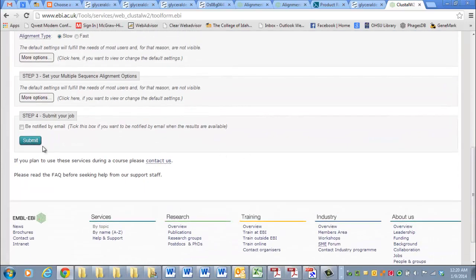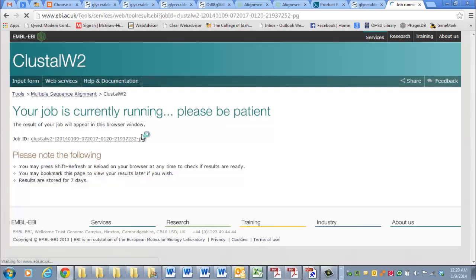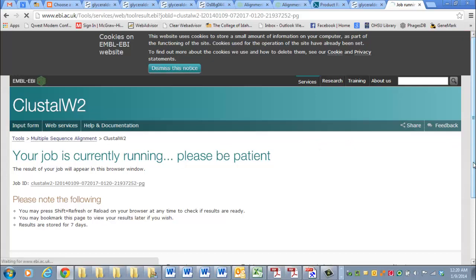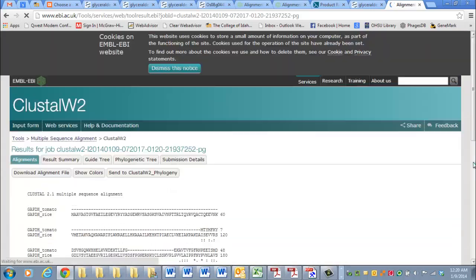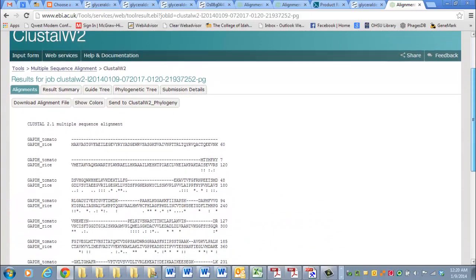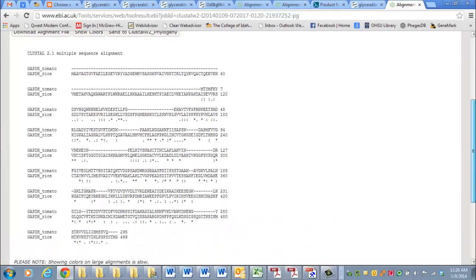If I submit, and then we wait. Hopefully it doesn't take too long. And then it brings up this nice sequence alignment. Right here. So this is how you get a protein sequence alignment.